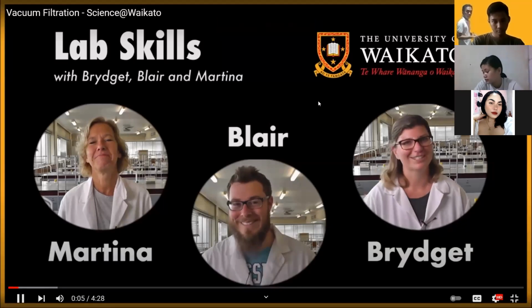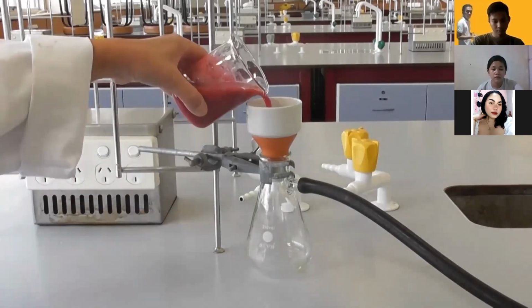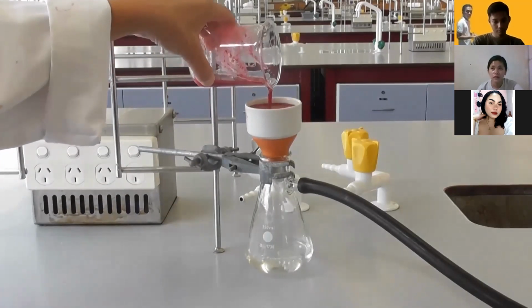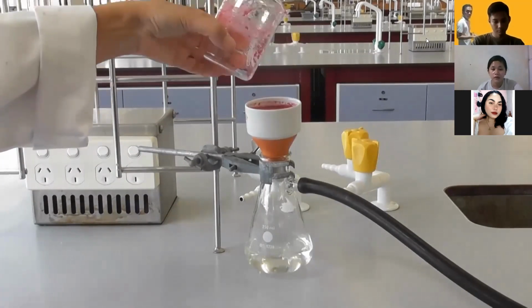In this video, we are going to show you how to carry out a vacuum filtration. Vacuum filtration is a special type of filtration where a liquid is drawn through a filter by applying vacuum. This is generally used to collect a solid product.